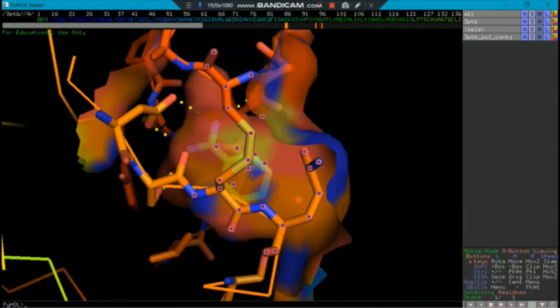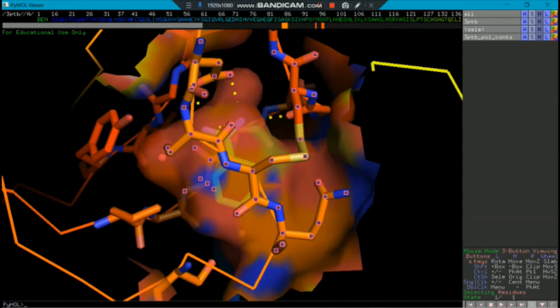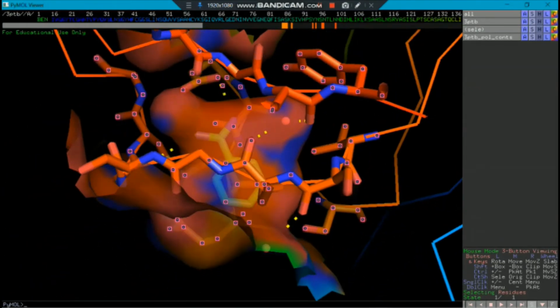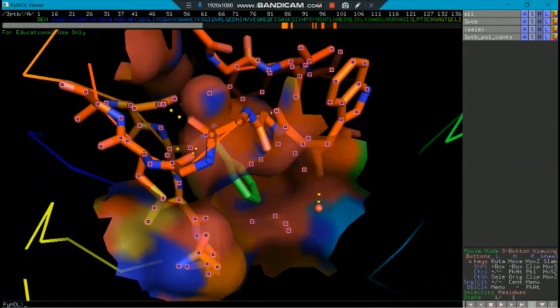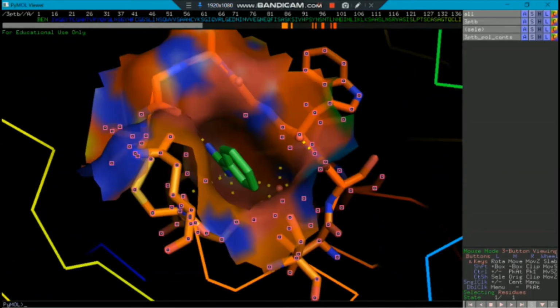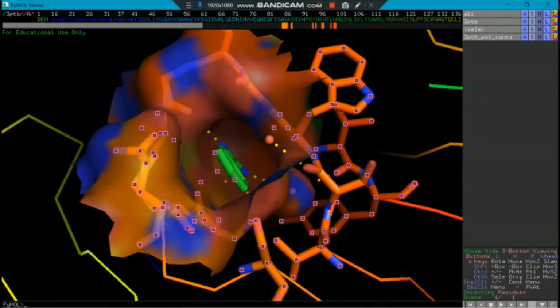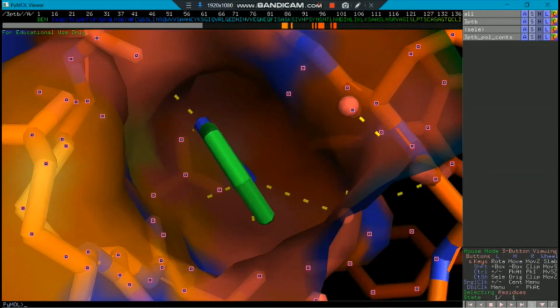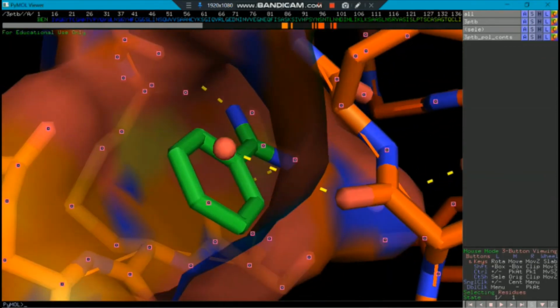Okay, so now we are going to select all of the amino acid residues which are there. Make sure you select all of them. Okay, so I just rotated a little bit and all of them are selected. I think something is remaining. Yeah, this amino acid is remaining in the upper portion. Okay, so I would select that also, and one more is there. Okay, so now they are being selected, and see, we have certain interactions, no?